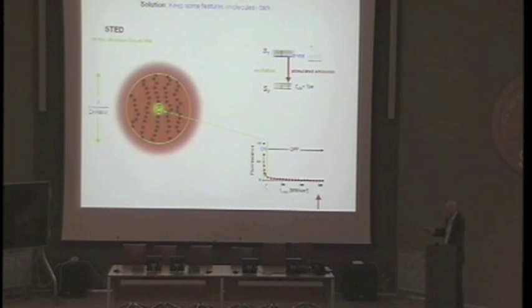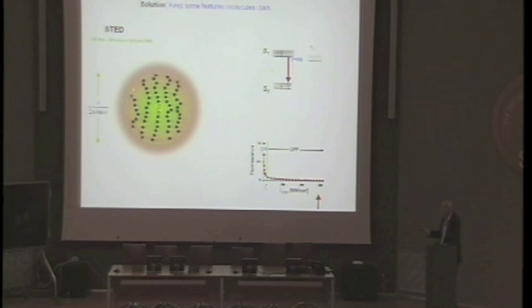So we just crank up the beam, and then more molecules will be silenced, and only those molecules here are in the end remaining in the excited state. And so we can separate those from those, because only those are capable of sending light back, despite the fact that all of them are flooded with green light. We can't change that. All flooded with green light, but these are dark, and those are bright. And because they are now different in the capability of emitting light, we can separate them. We can separate these three molecules from the rest.